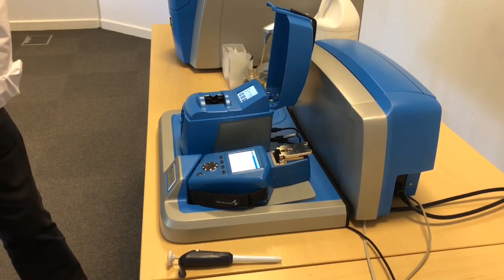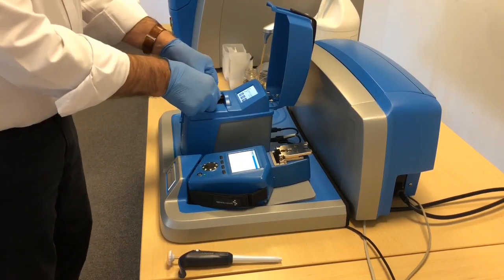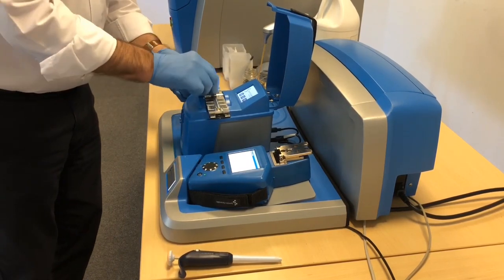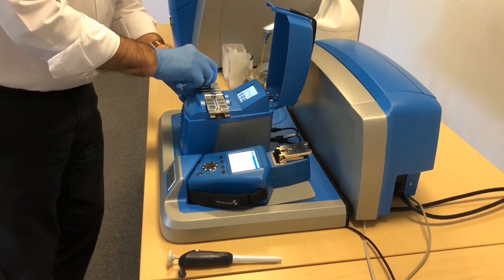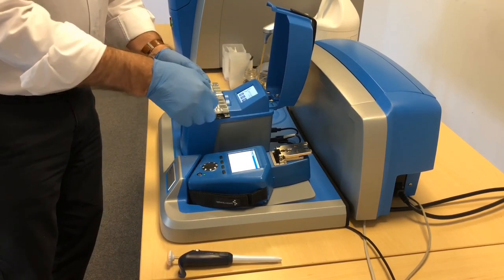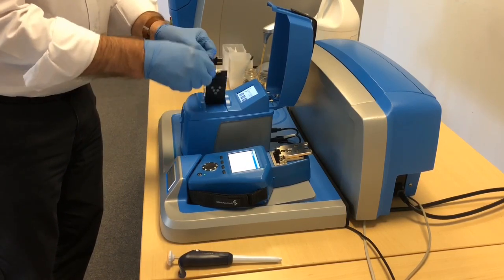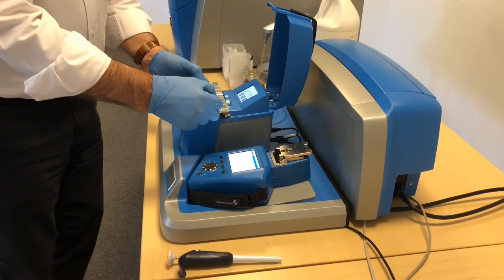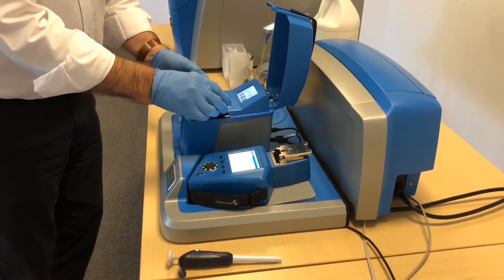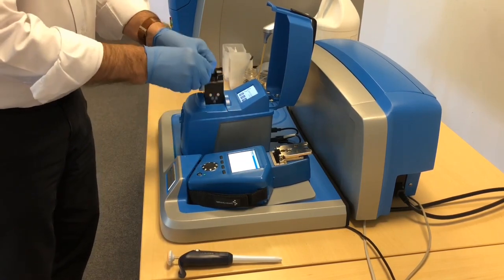You can see now that the viscosity measurement has finished. It's just under 200, so I wasn't far wrong with my guess. And we can clean up the viscometer. As you can see, the viscometer is very simply 2 halves of an aluminium plate with some sensors that form a tube, and the oil dribbles down there past the first sensor and triggers the final sensor when it gets to the end, and that's how it calculates the viscosity. These are heated to 40 degrees, of course.